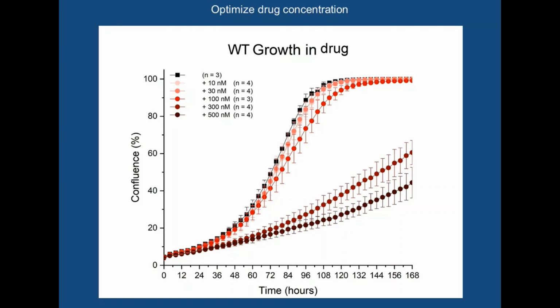So we have a drug that's got maybe a published IC50, or one that we've determined enzymatically, but we really want to see what's optimal for this particular cell type. And so very rapidly, again within a week's time, we can generate data that tells us what a good concentration is, at least to start our experiments.